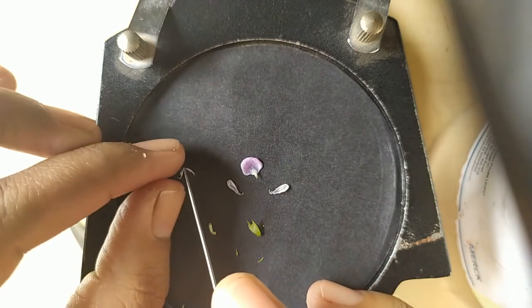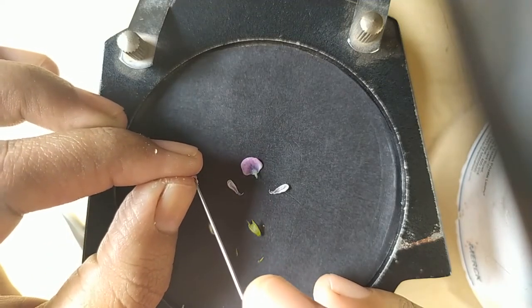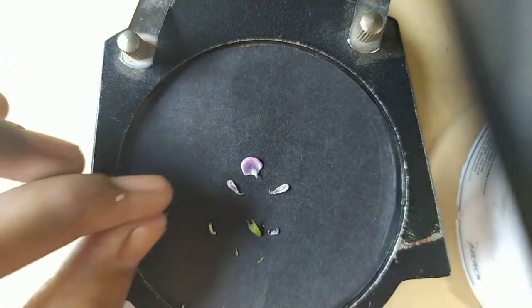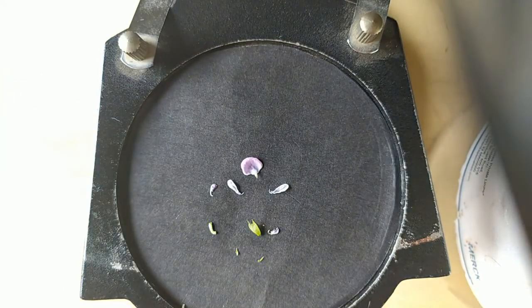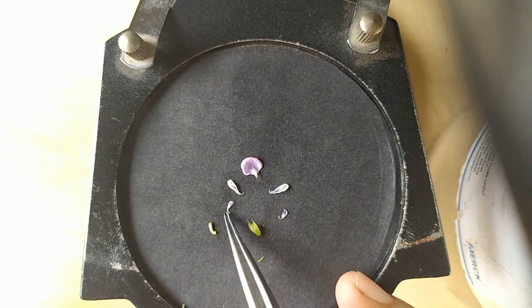The keels are fused together at the top, so with the help of a needle you can make them separate. Then separate it with the help of the needle and arrange it in an inward direction.